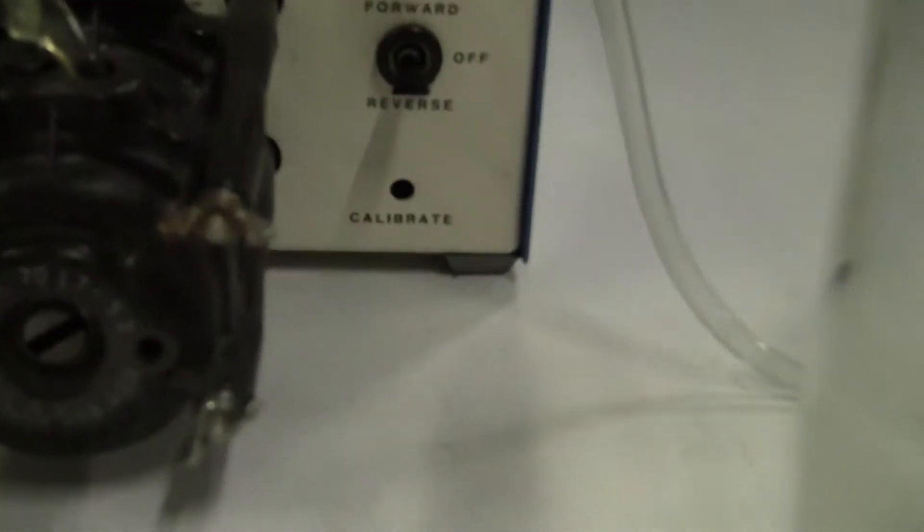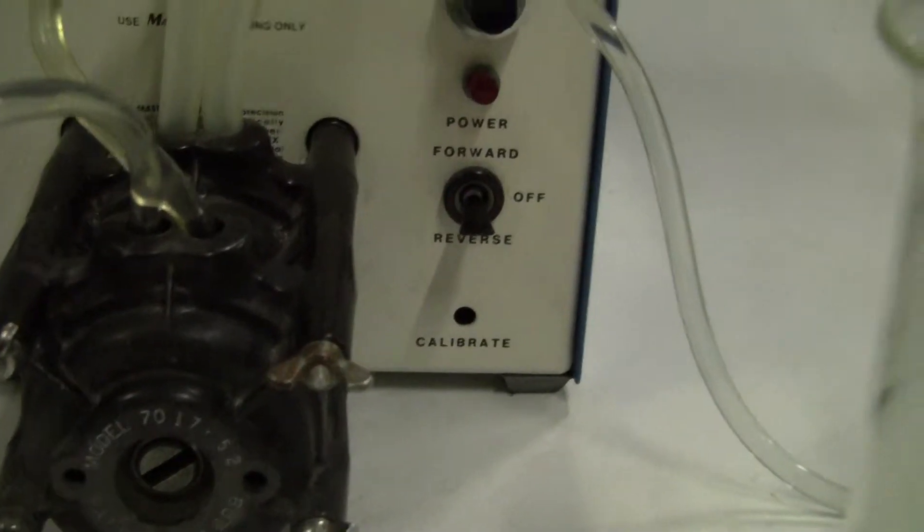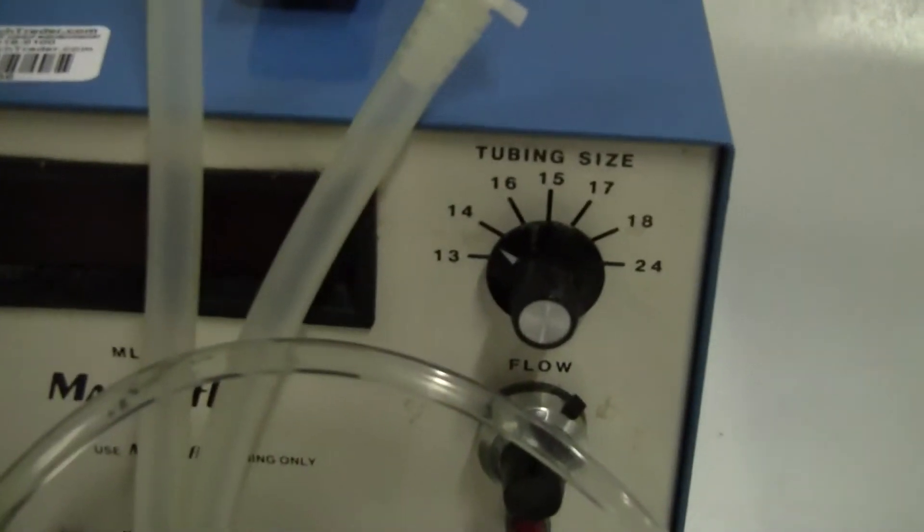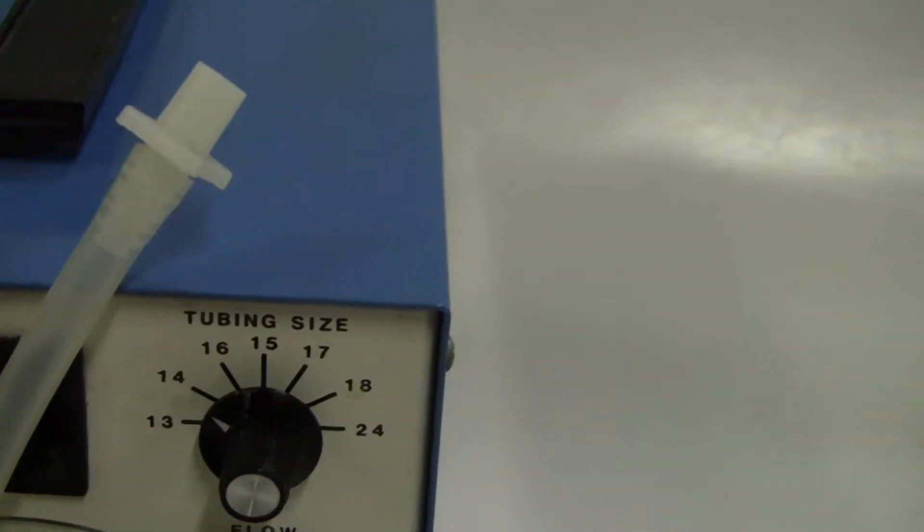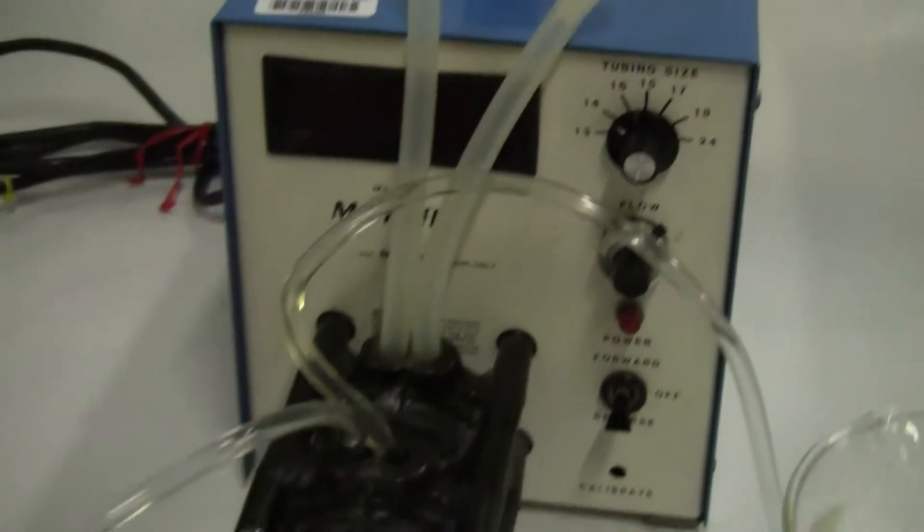It's currently fixed with two heads, Model 7017-52. It can accept many different tubing sizes. You can see it changes and it will change the different flow rates. It has a digital output for the flow rates. Let's turn it on and take a look.